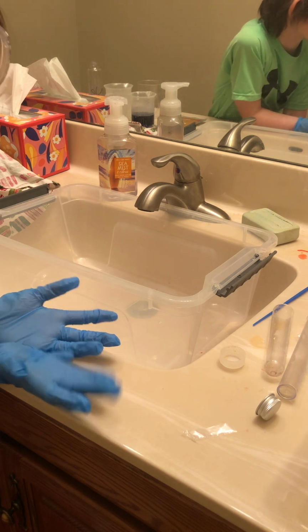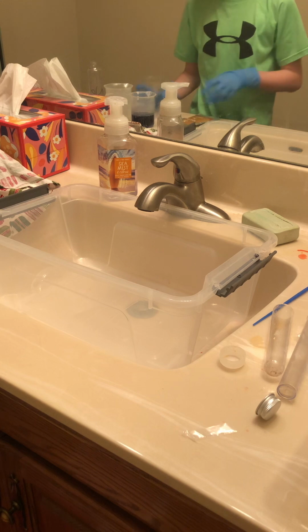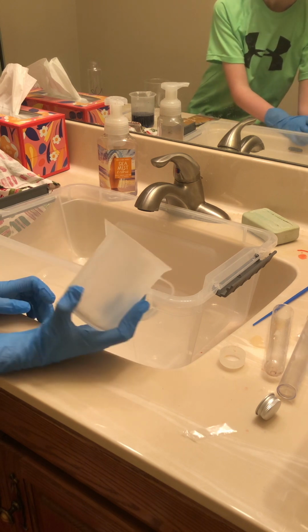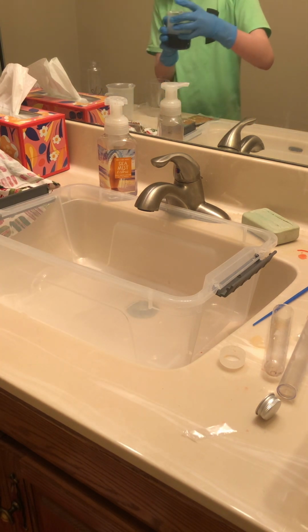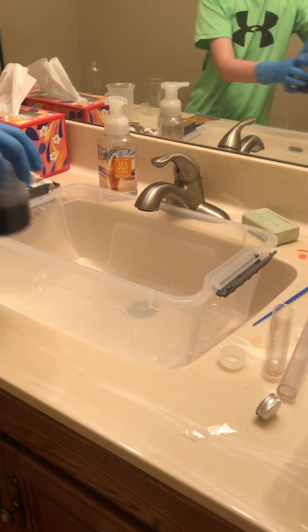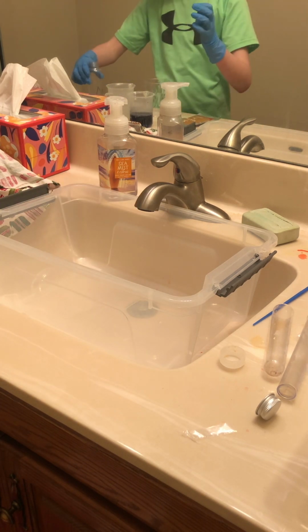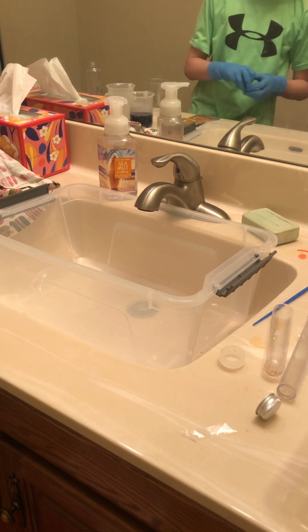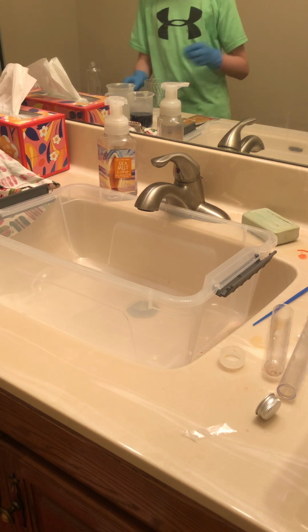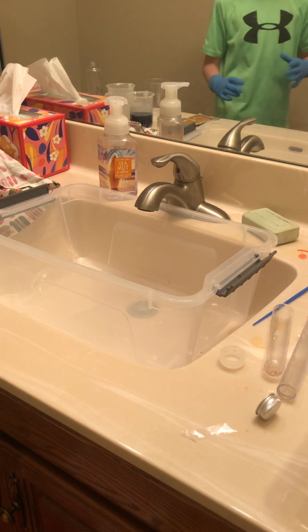If you wanna do what I'm doing, all you need is some citric acid, a cup, a 250 milliliter beaker, a 200 milliliter beaker. This is baking soda solution, baking soda liquid, a bottle, just another little bottle. And only if you want to do exactly what I do, a stopper, a pipette, and a small tamping rod. So, let's get to it.